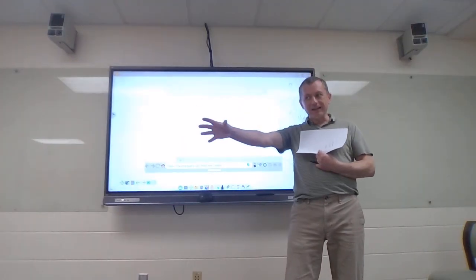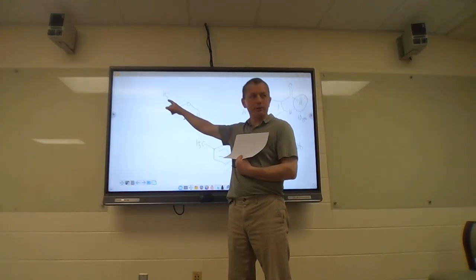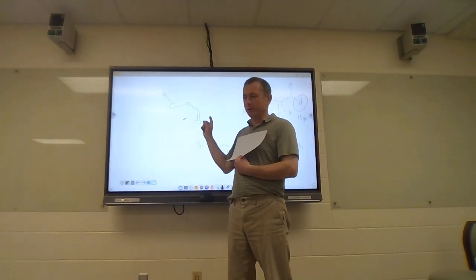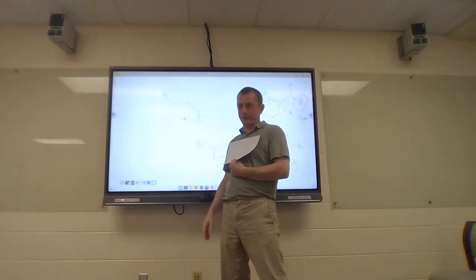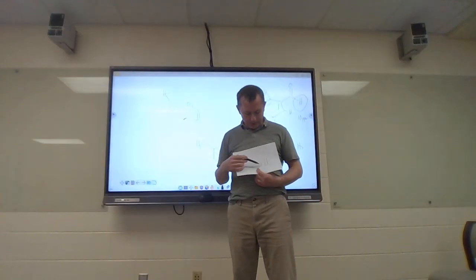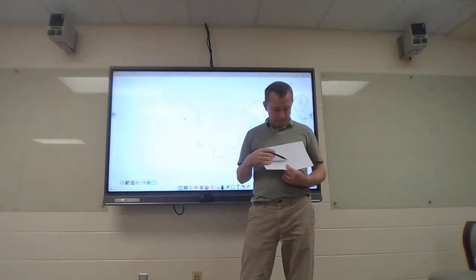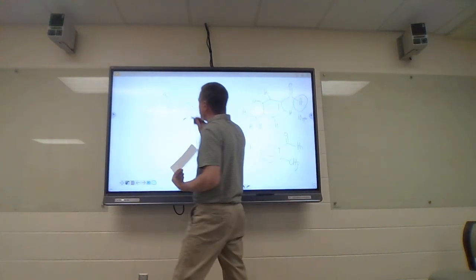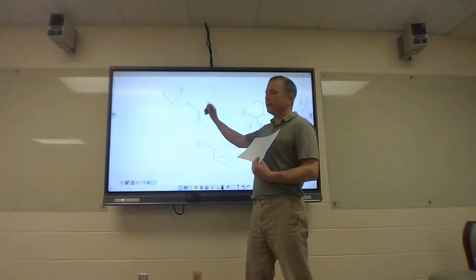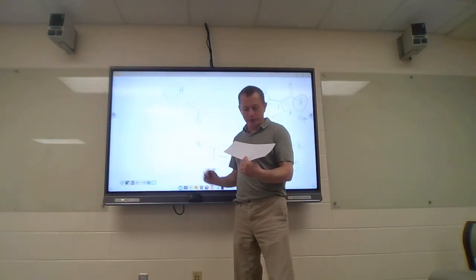See my point? Your chemical shift table can tell you a lot of things, but I'm telling you right now, if you see a hydrogen around 4, you've got to look for an ester. Could be wrong, but more often than not, you're looking for an ester. You've got 2 oxygens in there you've got to use somehow, so go looking for an ester. How many hydrogens are on that? See 2? So I'm going to put 2 hydrogens there. So what might be on the other end of that carbon-oxygen double bond?